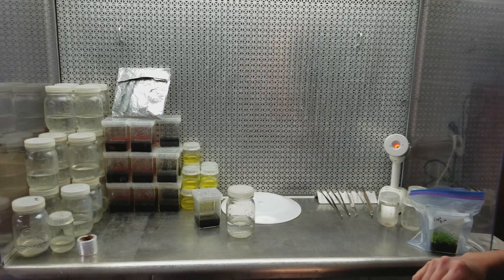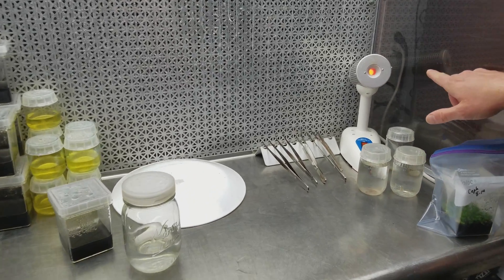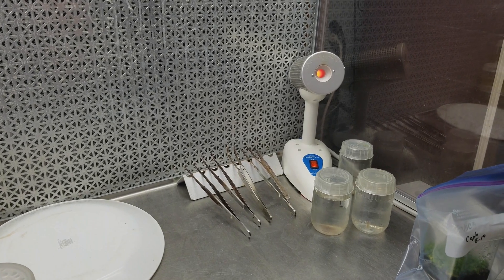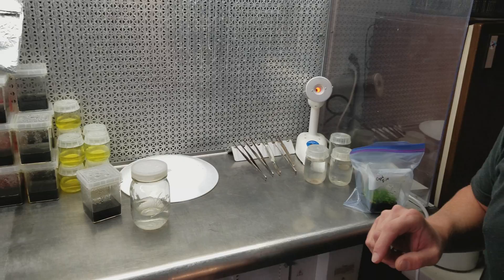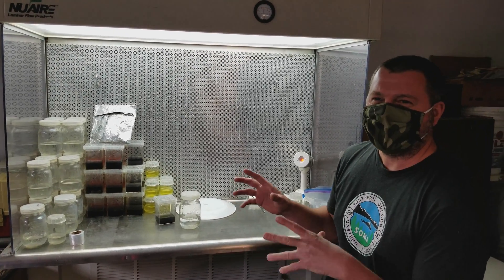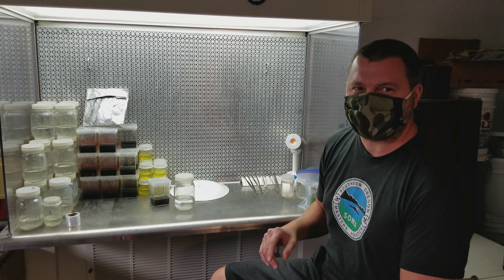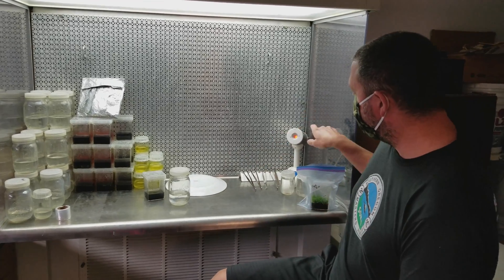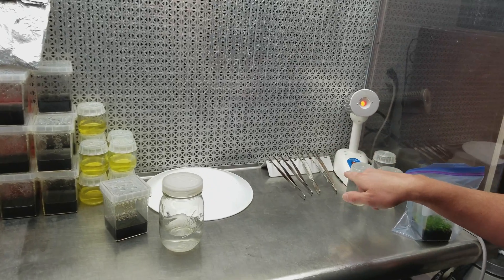I'll just walk you through what's in here right now. On the far right side here is my bacticinerator — I just got a new one. Unfortunately the one I had for 10 years quit working right as COVID hit, and everything related to sterilizing stuff was super expensive. But I had to replace it because I have to use it for tissue culture work.